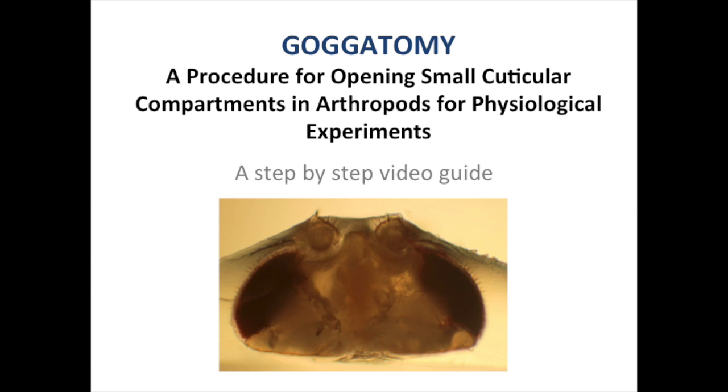A step-by-step guide to the Goggatomy procedure. This video will demonstrate how to open cuticular compartments in arthropods where the live contents can then be used for physiological experiments. Here we will use the antenna of Drosophila melanogaster to demonstrate this technique.